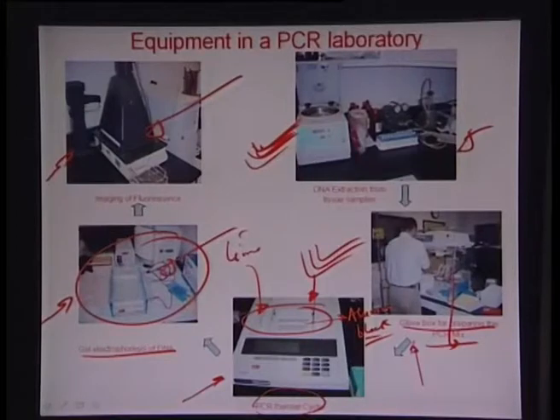So there have been initiatives to compress all of this, the size of a whole room-size laboratory, onto a single chip, and in fact there are ideas and papers developed by researchers around the world where they have seen how miniaturization of this whole lab on a small chip can help in extremely rapid analysis of DNA.